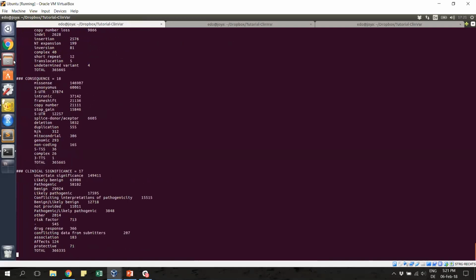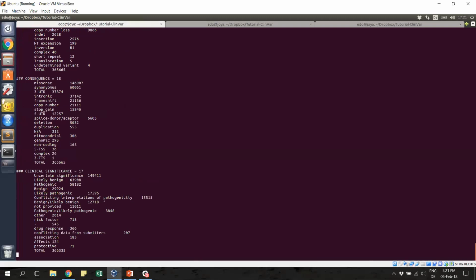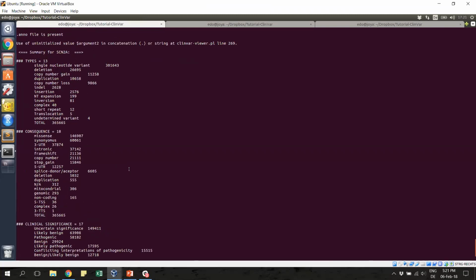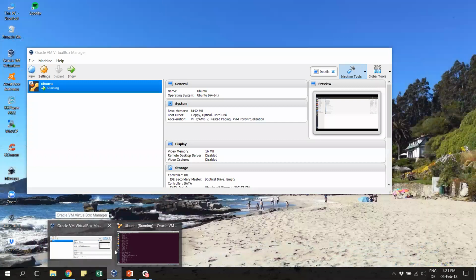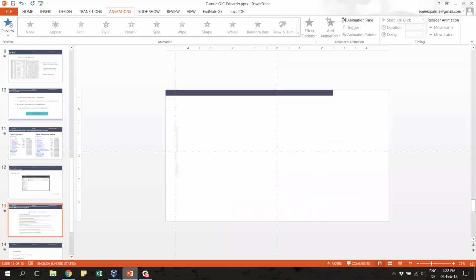Again, in the background, a file specific for this is generated, which I don't see right now. Oh, there it is. But yeah, this is the usage that the program has. It's really simple, but it's also really fast and effective in what we want to do.